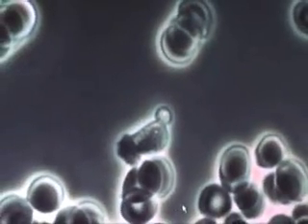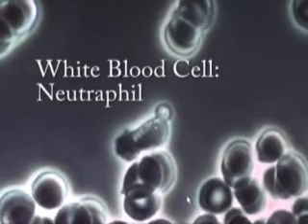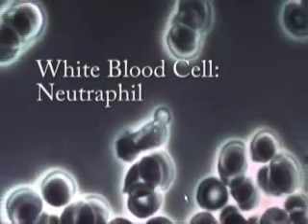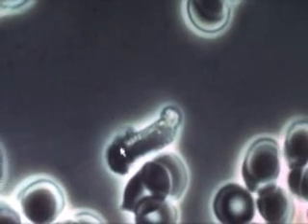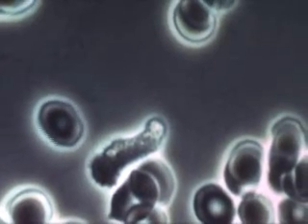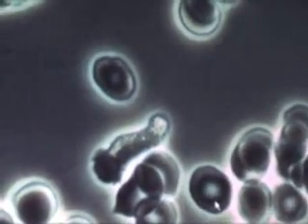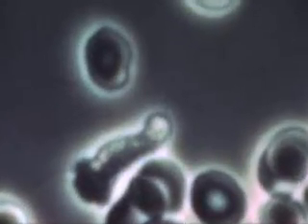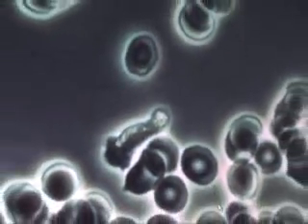Moving so slowly through the terrain — that's a white blood cell, a neutrophil to be exact. It's got a nice brightness, and what appears to be its tail section, or its mouth, since that's the direction it's heading. That glowing at the end — it might have picked up an acid crystal, which is rare to see in a neutrophil.